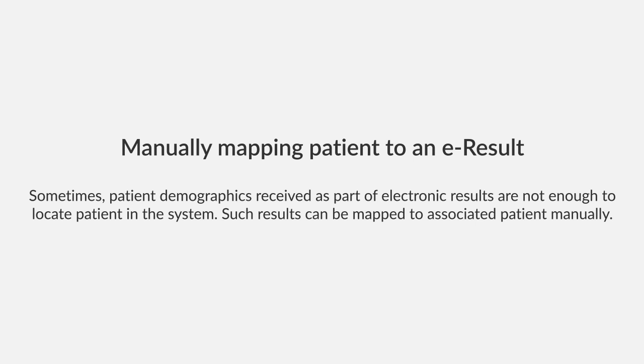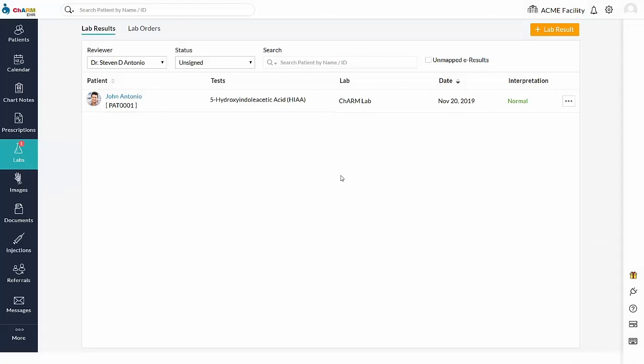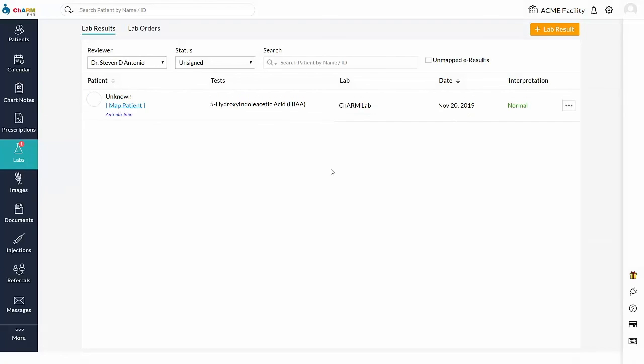Manually mapping patient to an unsolicited result. Unsolicited results may be received with incorrect patient details. Such results will not be able to map to the patient automatically. They are listed in the lab results section with an unknown patient.